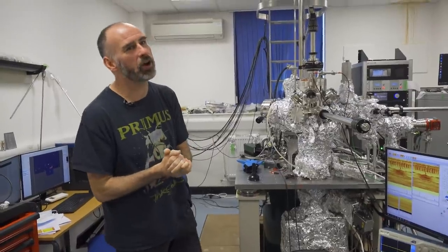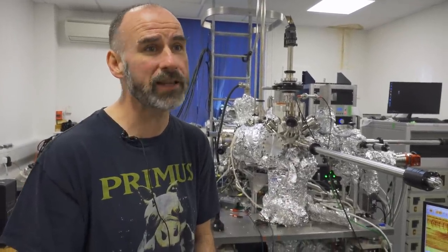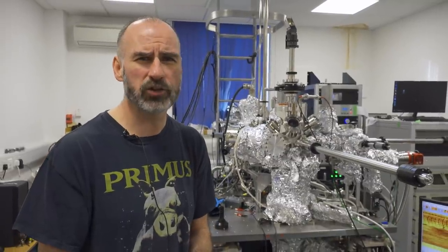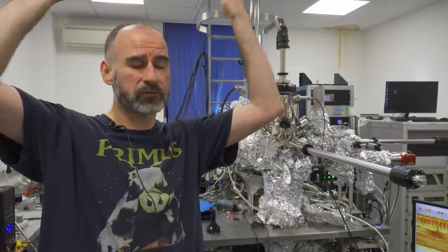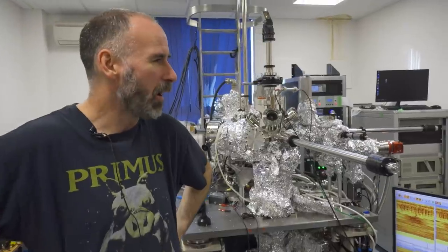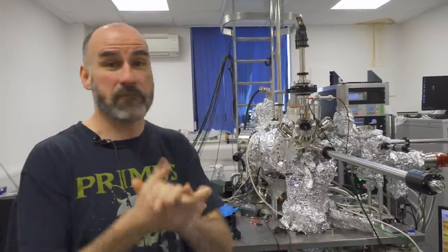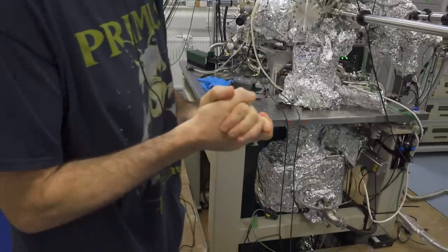Yutaka worked extremely hard for 4 weeks or so, really doing all the commissioning and all the site acceptance in terms of what are the noise levels, does the magnet work when we go up to the highest fields, does everything cool, and yes, everything cools, down to 320 millikelvin, which, as I might have mentioned before, is 10 times colder than the cosmic microwave background radiation in the universe, the leftover remnants of the Big Bang radiation. So that's a pretty cold place. Down in that magnet can be a pretty cold place in the universe.